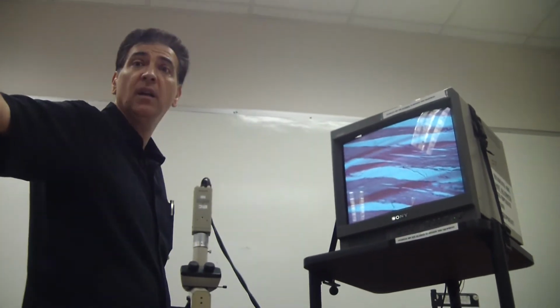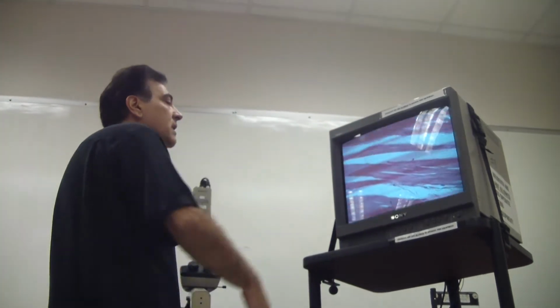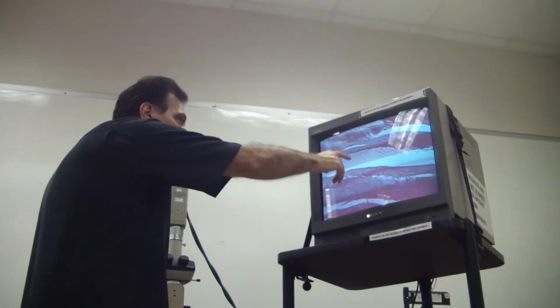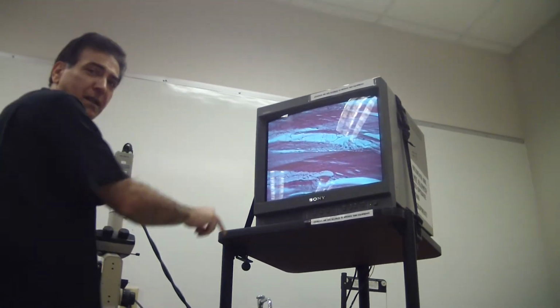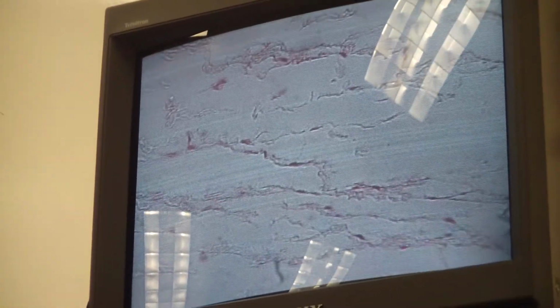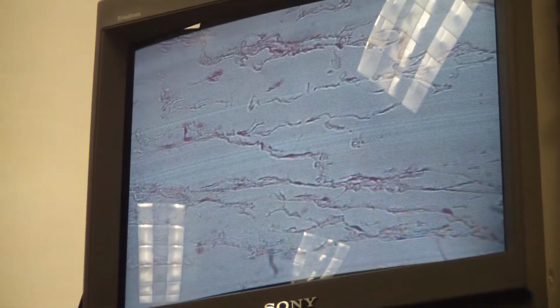But again, it depends where you are, but it doesn't matter. The handout says to identify the tunics. So muscularis externa. But I'm just telling you, just in case you saw it, you can remember, these are skeletal muscle. You don't want to get confused, wondering why this is not smooth muscle. Understand that they took the tissue from the very beginning. But if you go further down, then you see smooth muscle. And then, of course, the adventitia, which is connective tissues, collagen fibers, adipose.